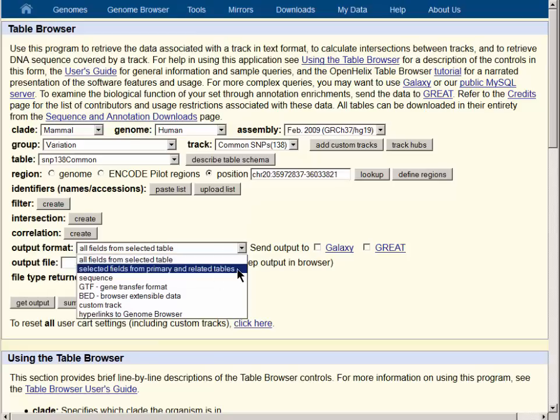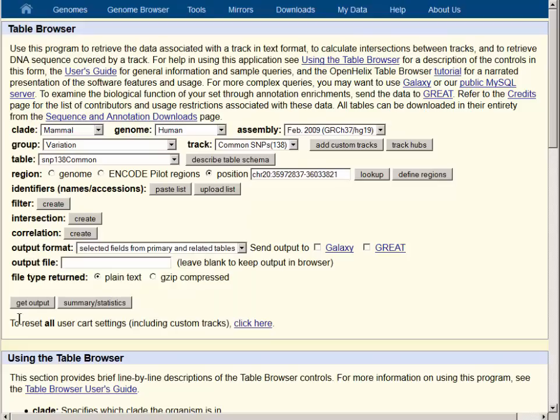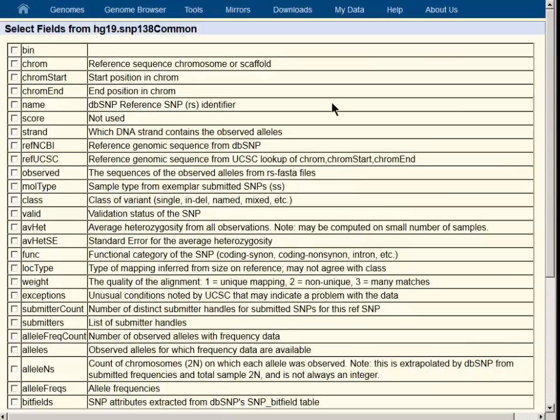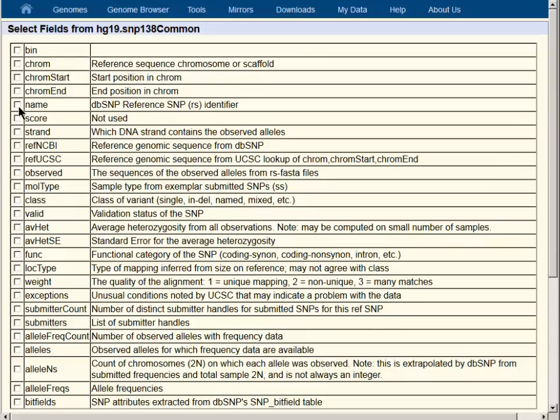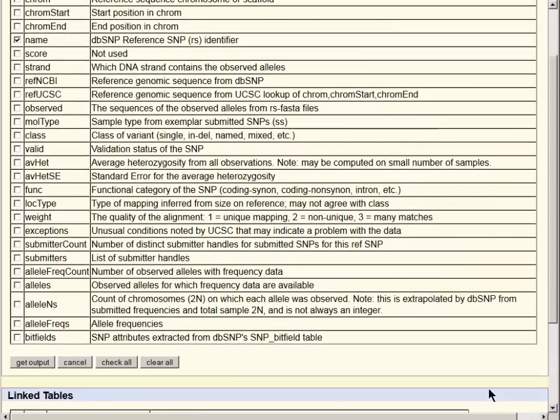For output format, we choose selected fields from primary and related tables to get to a page where we can pick the columns we wish to save. The Get Output button takes us to a place where we can choose which features we wish to download. On this page we can choose the name of the SNP, and we can also choose the genomic coordinates if we're interested. We can also choose a number of different items such as the function and the allele frequency from this list. The Get Output button takes us to the list of SNPs.